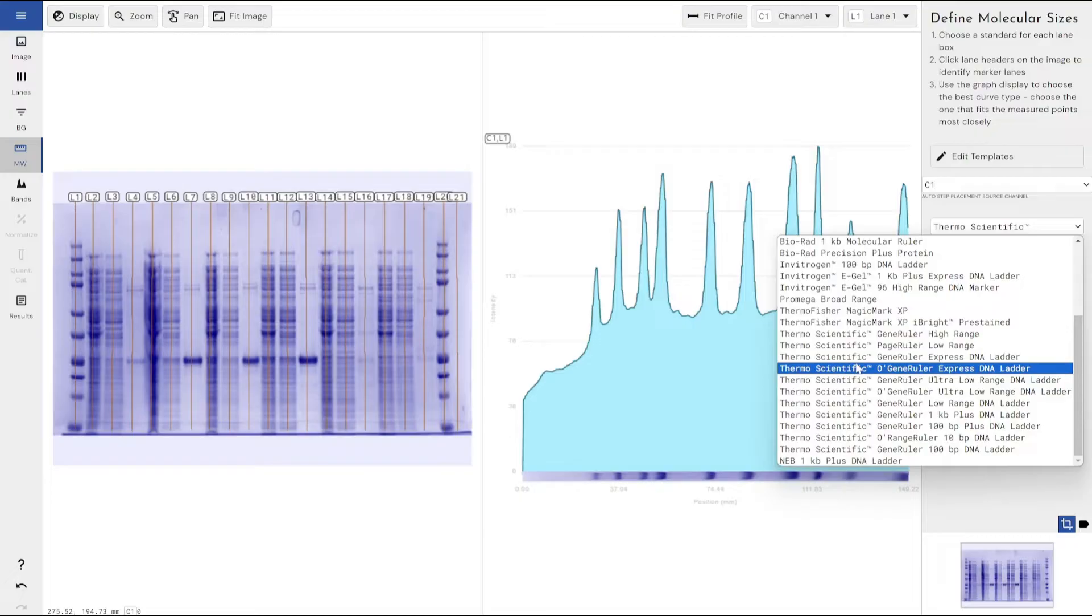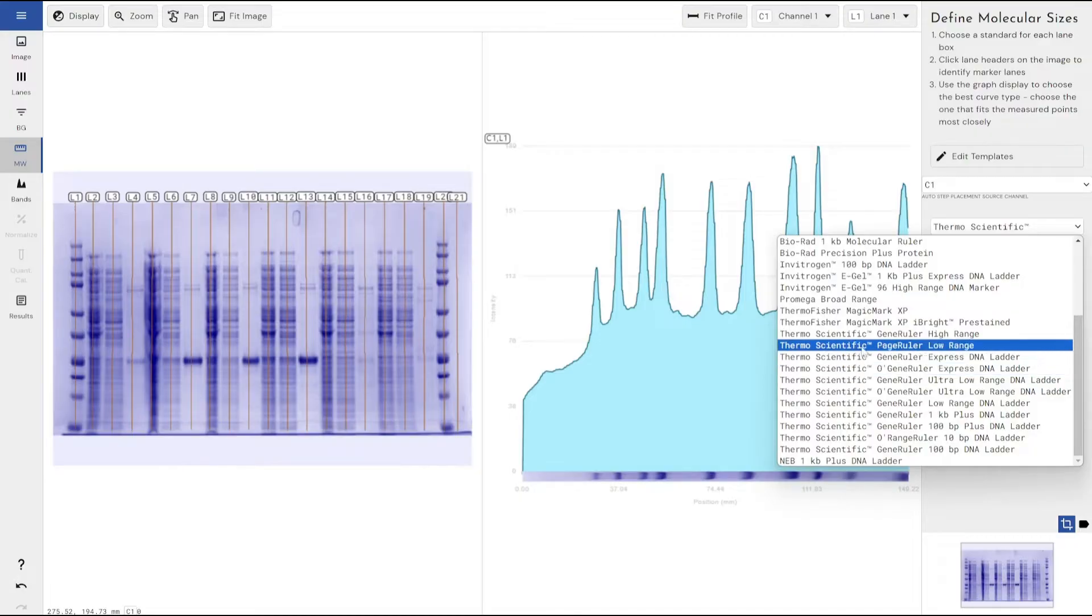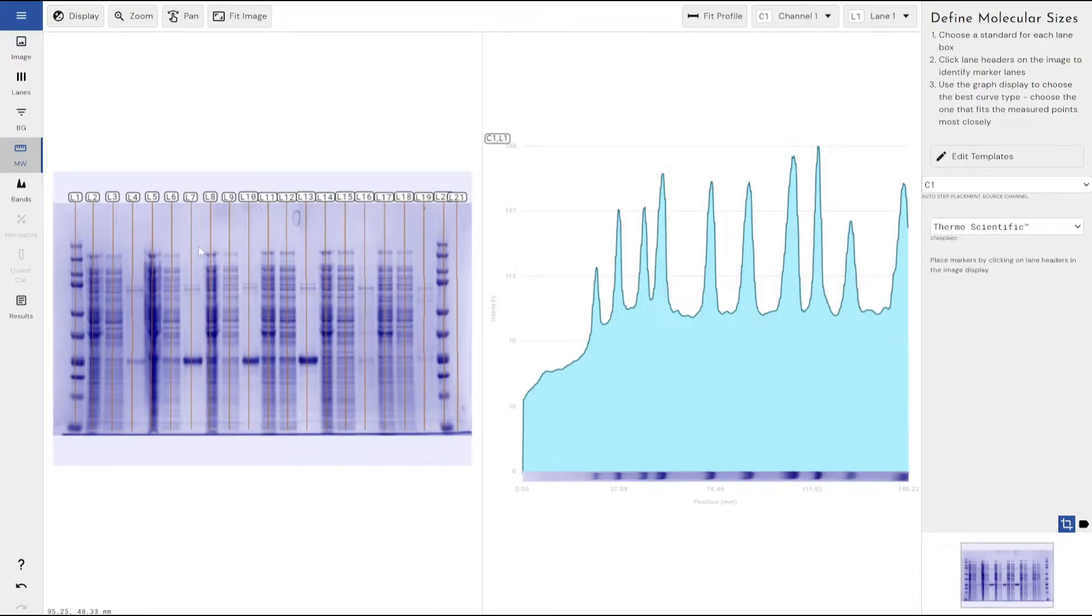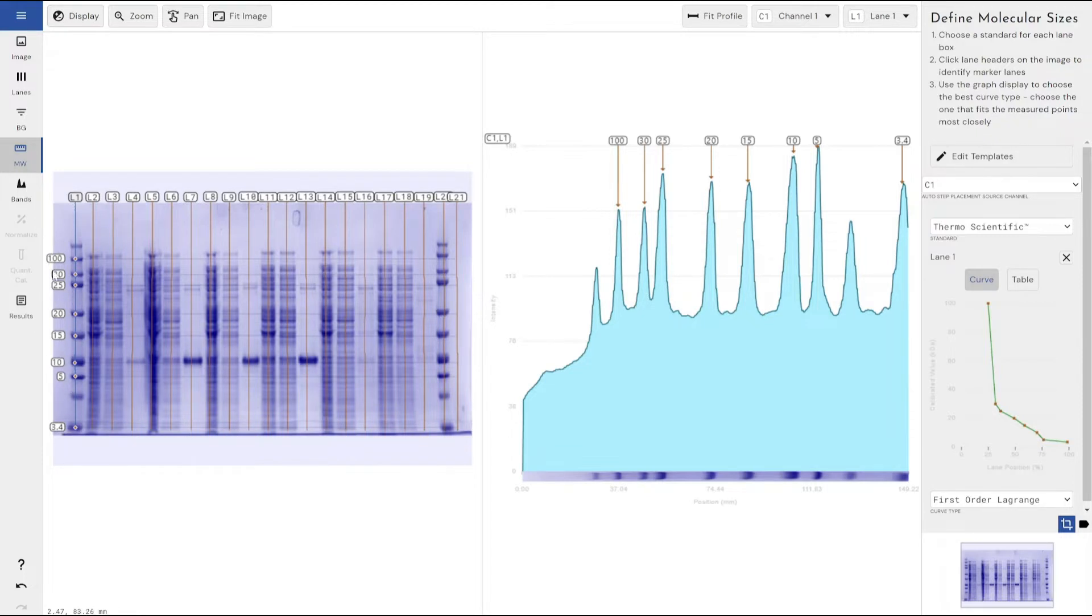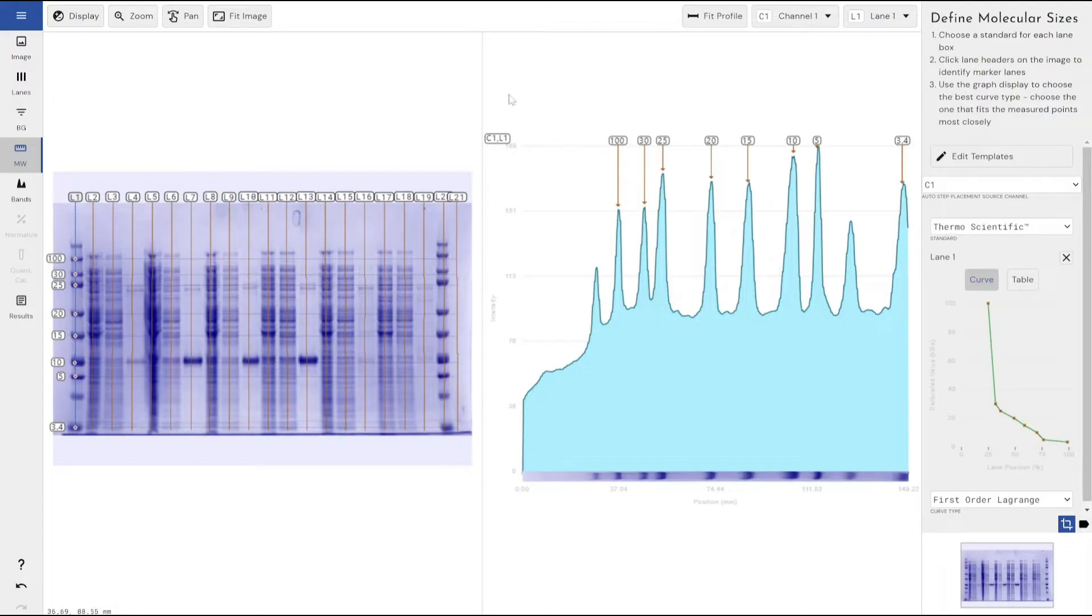One way to check would be to select one and then apply it to your ladder and make sure that you've got the right number of standards, the right number of steps within your molecular weight ladder and that they're displaying the correct value for each step that you would expect from the manufacturer's instructions.